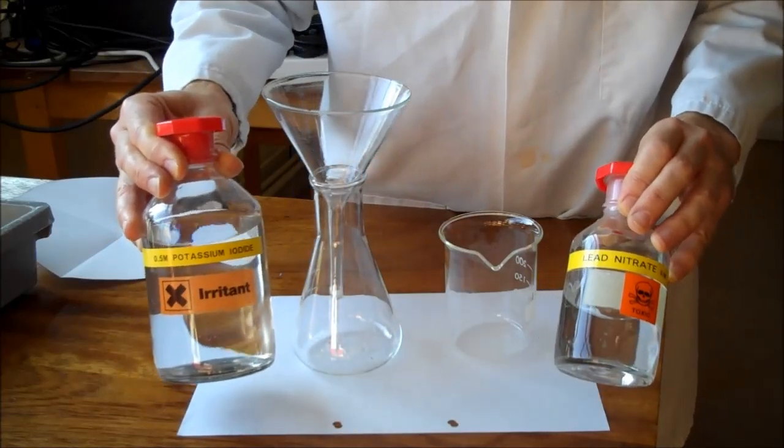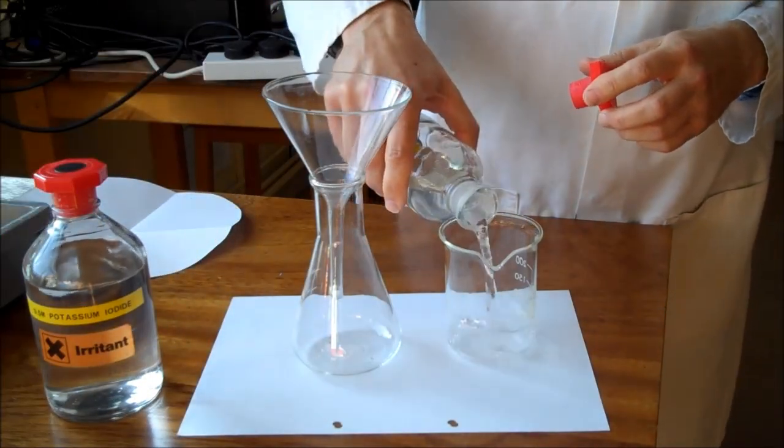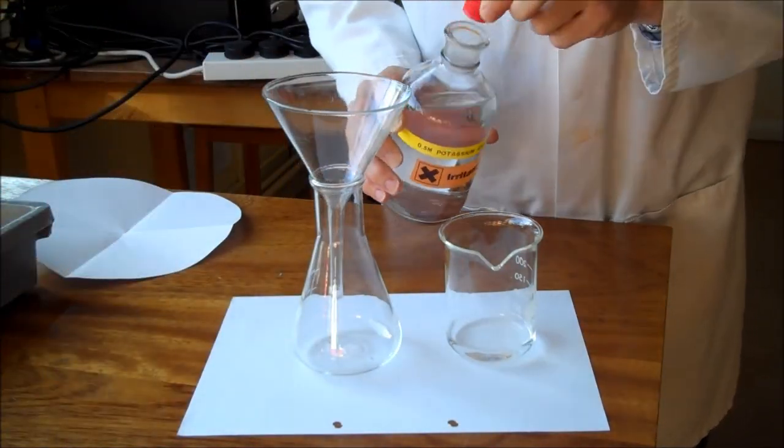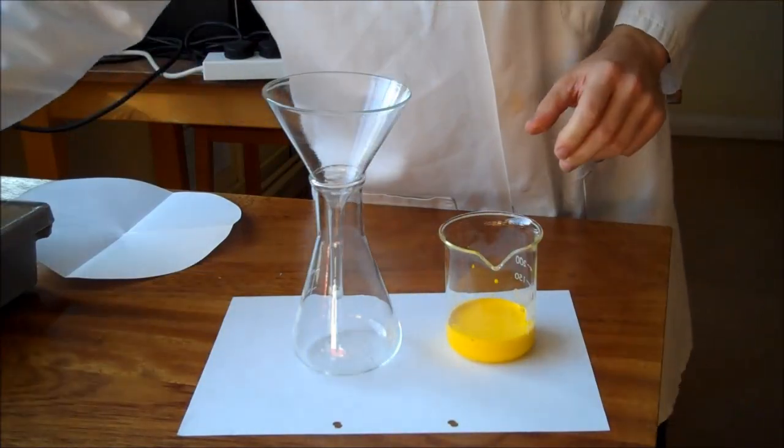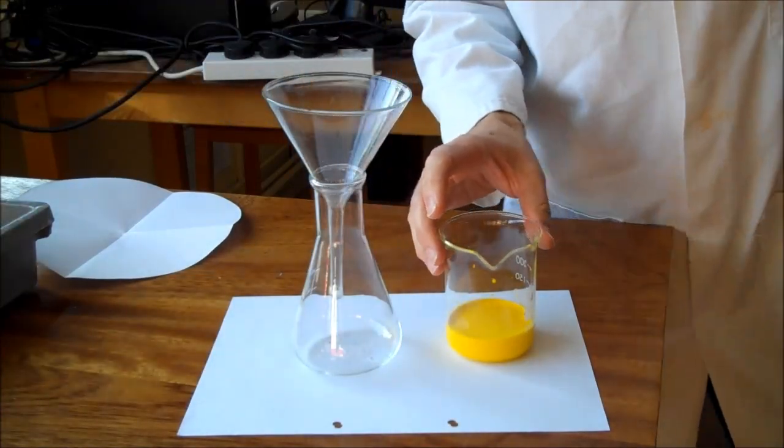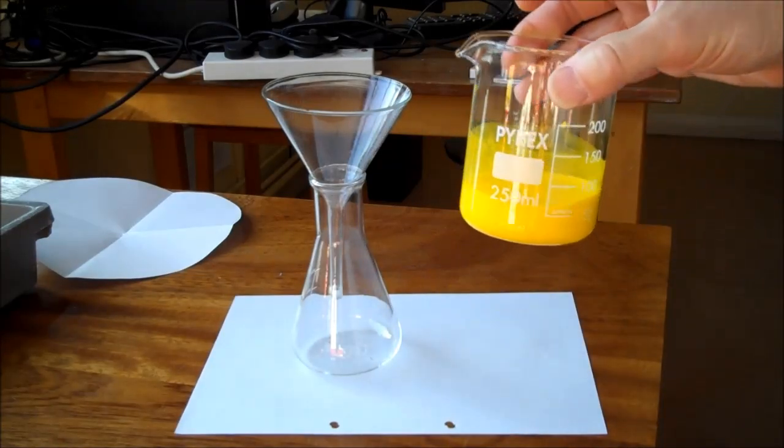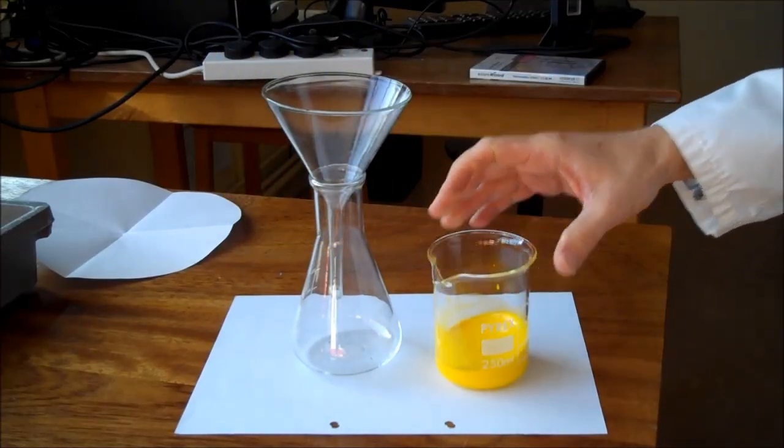I'm going to put a bit of lead nitrate in a beaker and then add some potassium iodide. We're going to make lead iodide and as you see it goes bright yellow but also it goes cloudy. It's murky, you can't actually see through it anymore. So how are we going to get the insoluble solid out? We need to filter it.